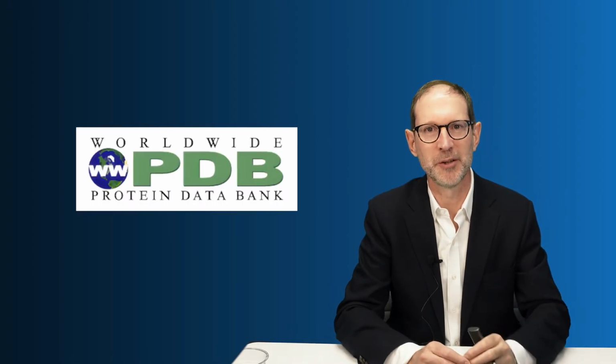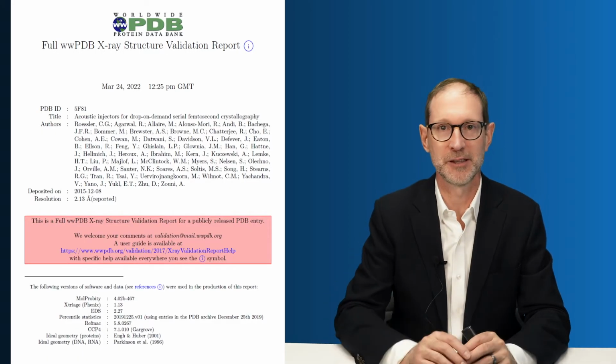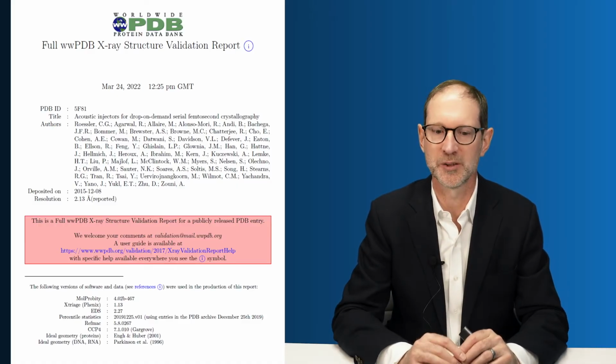I have good news. Never fear, the WWPDB is here. The Worldwide Protein Data Bank produces a structure validation report for every single structure in their database, again, no matter what the technique used to produce the coordinates was. And we'll look at the validation report first for crystallographic structures.